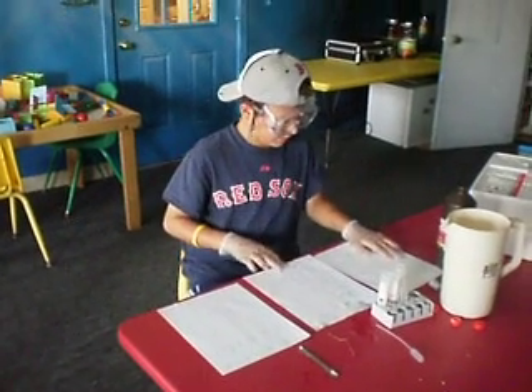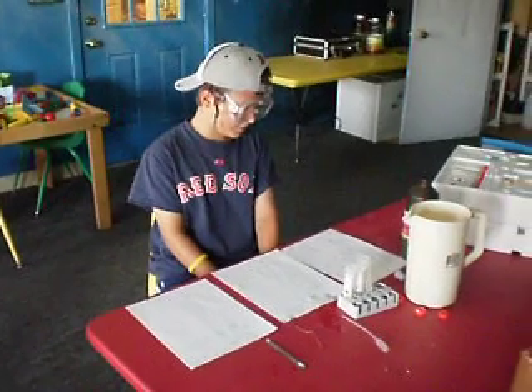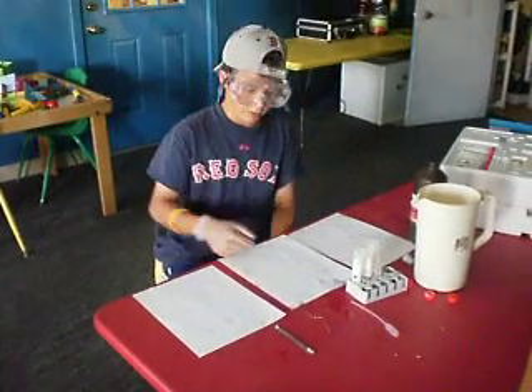Hi, my name is Andrew, and I'm a camper at Palo Science Chemistry Camp. Remember, if you have these materials, do this with adult supervision. Today, we are going to make a copper wire glow.